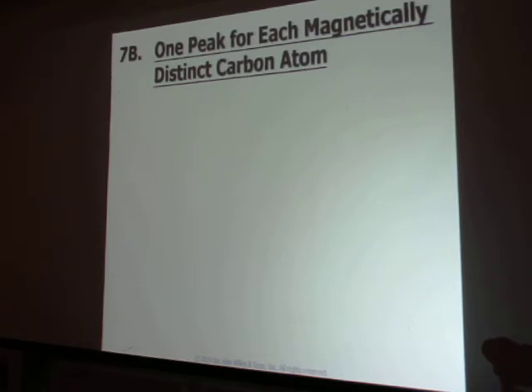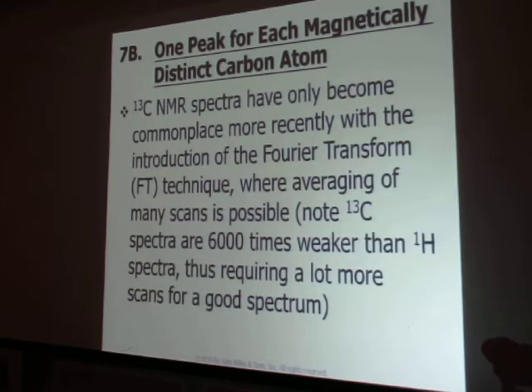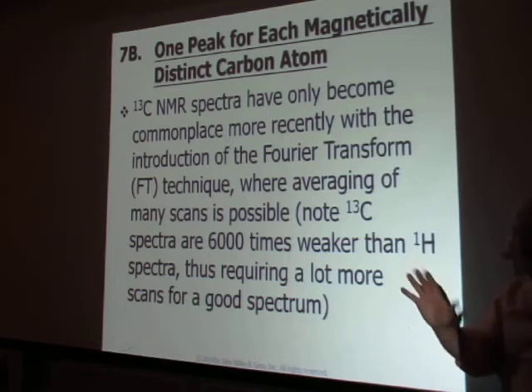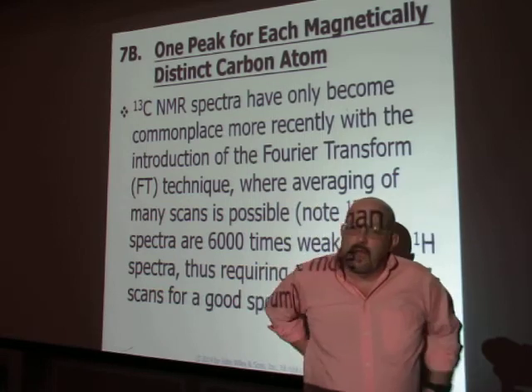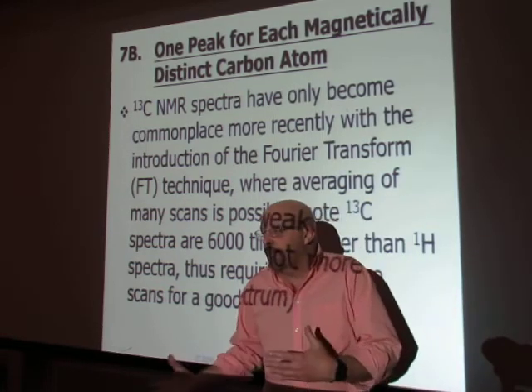Now, just like we had with protons, for every different carbon there is in the structure, you will have a signal for that. Just like we saw a signal for every different hydrogen.